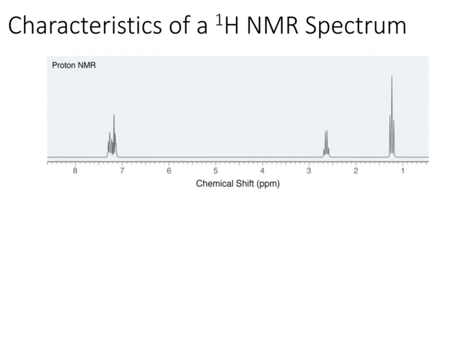When you look at a proton spectrum, there are a few terms that you should be very familiar with. The first terms are downfield and upfield. Downfield is on the left side of the spectrum, and that is related to a higher energy level. On the right, it is the opposite, upfield, and that is a lower energy level. Sometimes you will hear upfield shift or downfield shift. Downfield shift means the signal goes to the left a little more, and upfield shift means the signal goes to the right side a little more.